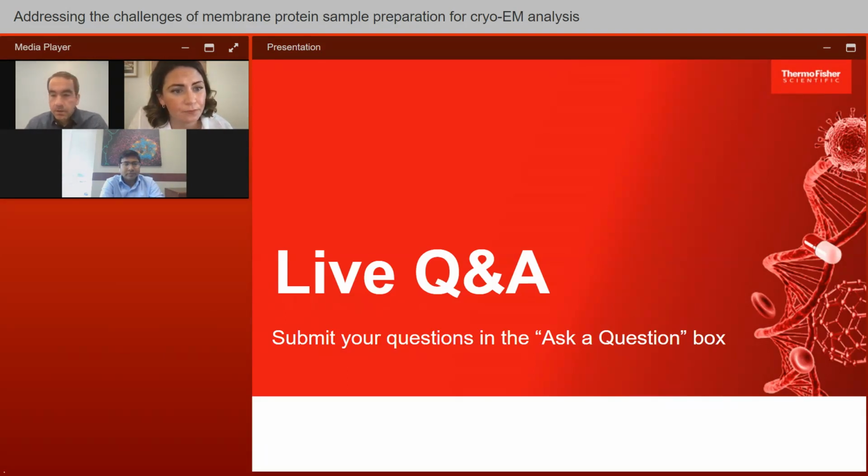Great. Here's, I think, another question that we can probably pose to the two of you, and maybe also get different answers. In summary, this person is trying to reconstitute their membrane protein into peptidiscs after being extracted in detergents, but they see this process of being able to remove excess detergent from a solution. Are there other methods, or what are the best methods, to remove excess detergents after reconstitution in other mimetics? They mentioned dialysis, SEC, biobeads. Any others? Maybe we'll start with you, Rosie, that you can think of.